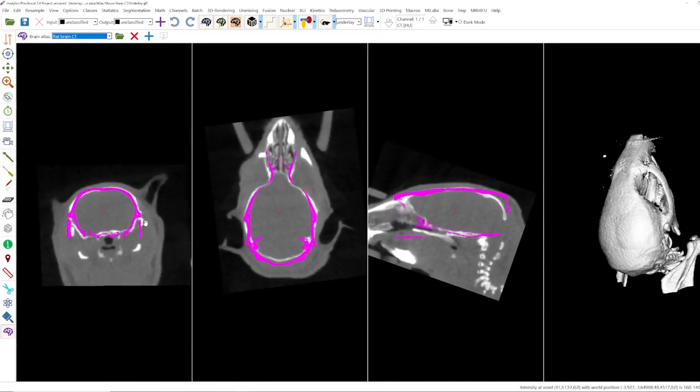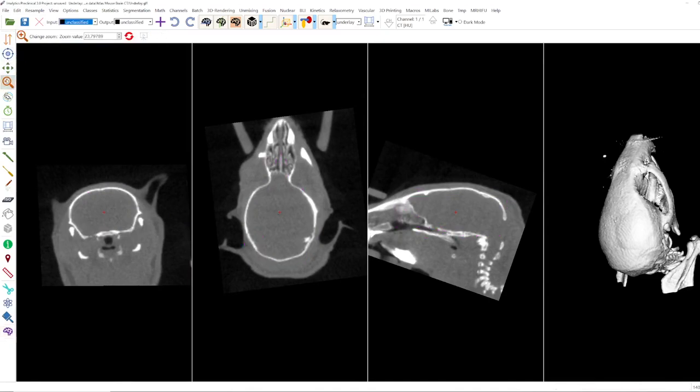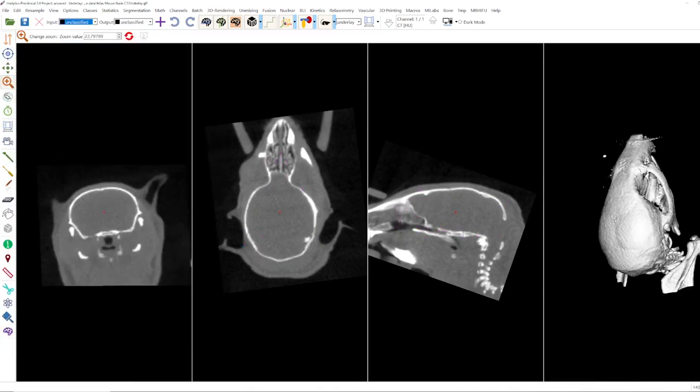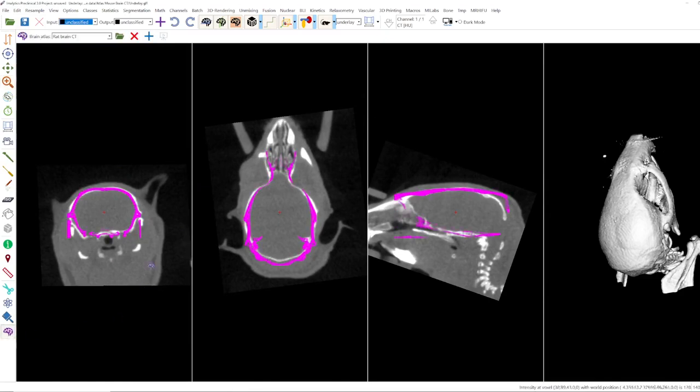However it's important to mention when you go to for example the zoom function then the atlas will disappear. So I recommend to use shortcuts.